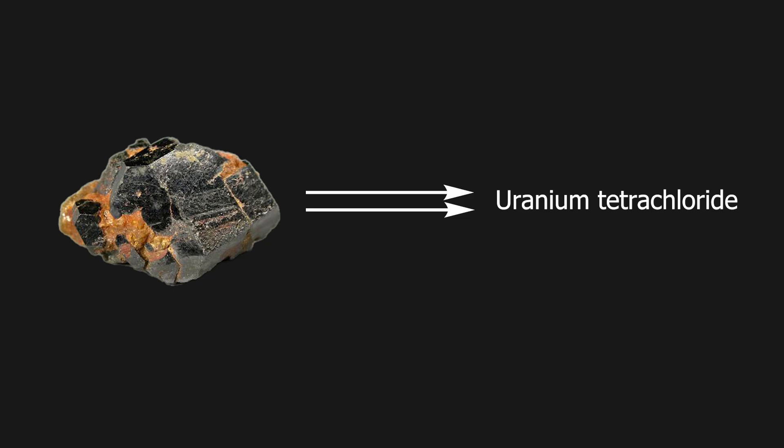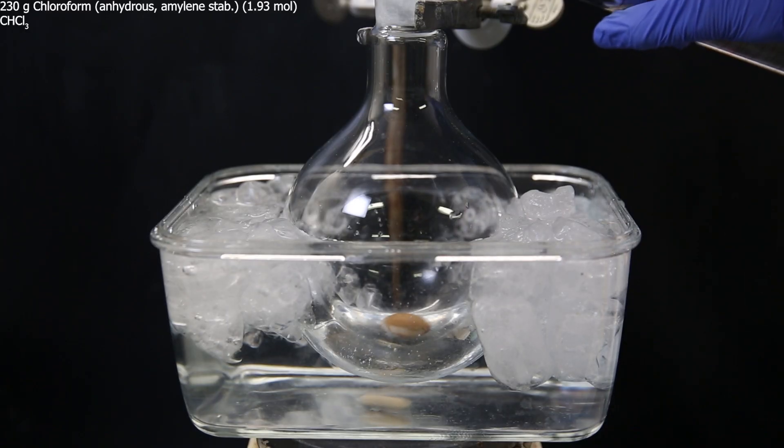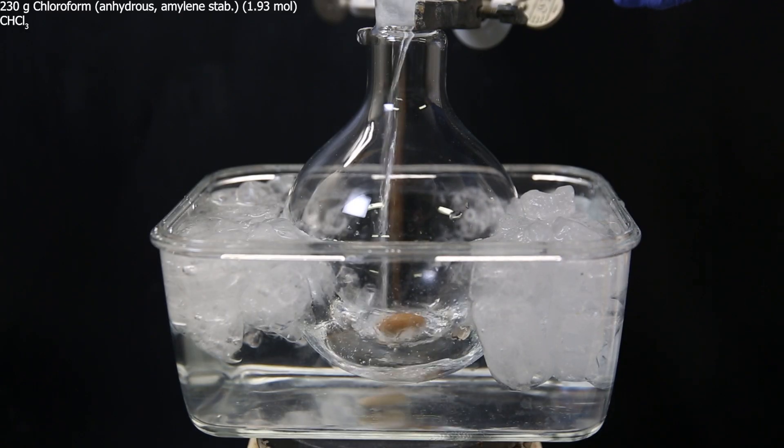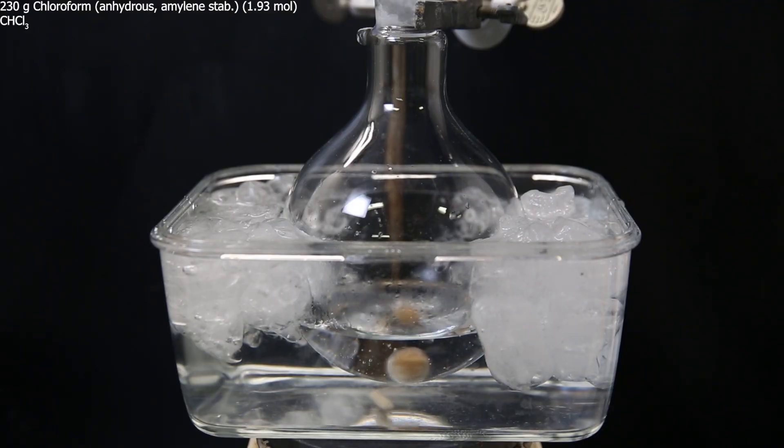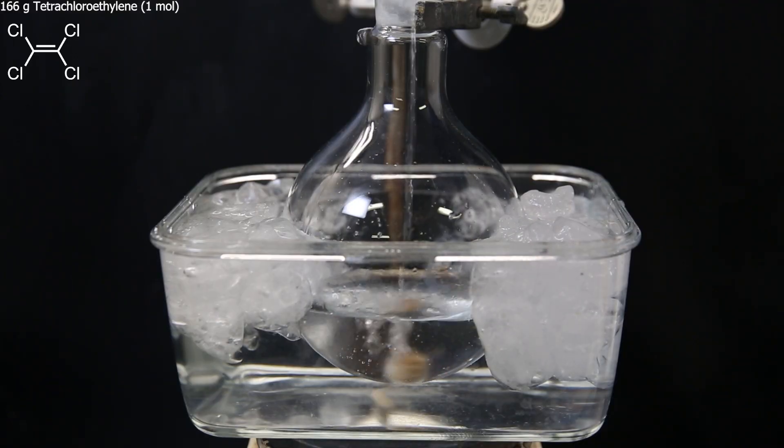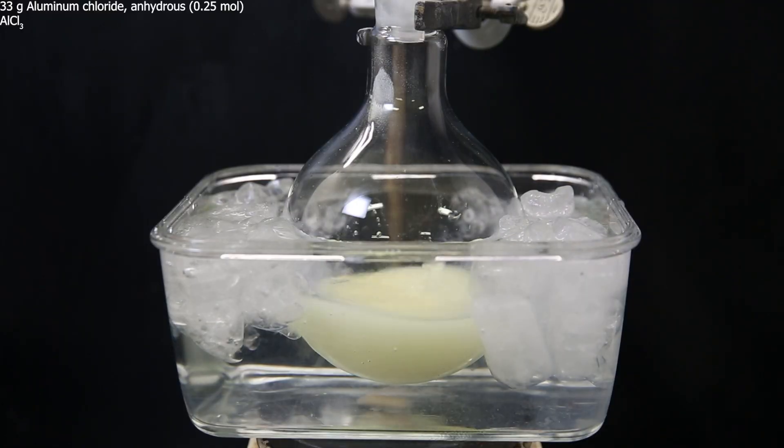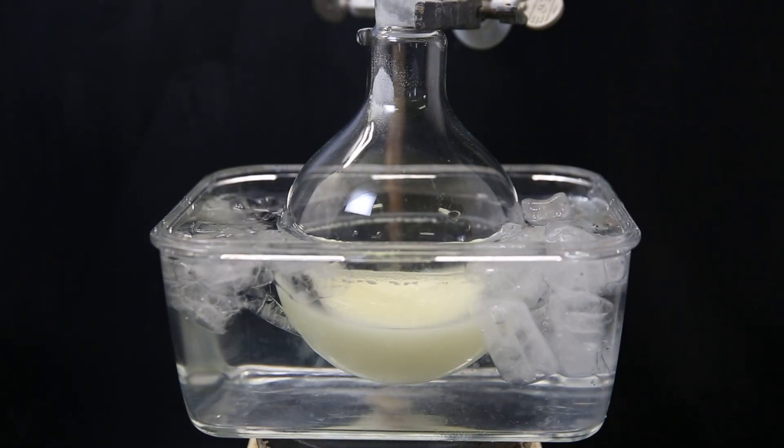Anyhow, before I can use a rock to make uranium tetrachloride, I have to prepare a reagent to do so, which is hexachloropropene. And it takes two steps. So I set up a large flask with a stir bar and submerge it in an ice bath. I then add 230 grams of anhydrous chloroform, which will act both as a solvent and reagent. I then add in 166 grams of tetrachloroethylene as a second reagent. Then as the catalyst, I add in 33 grams of anhydrous aluminum chloride. I leave it to stir for one hour in the ice bath to contain any exotherm and allow aluminum chloride to start its preparations.